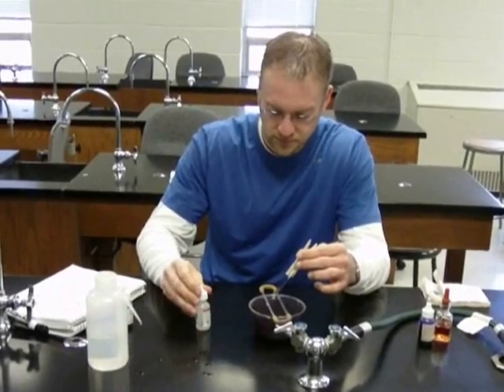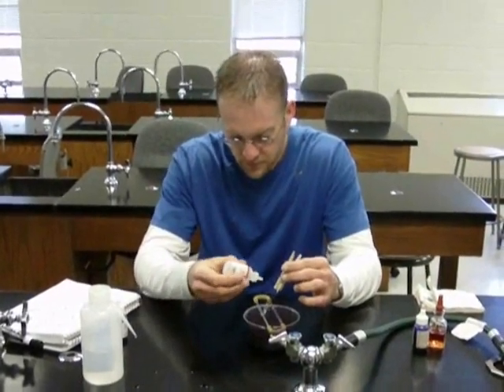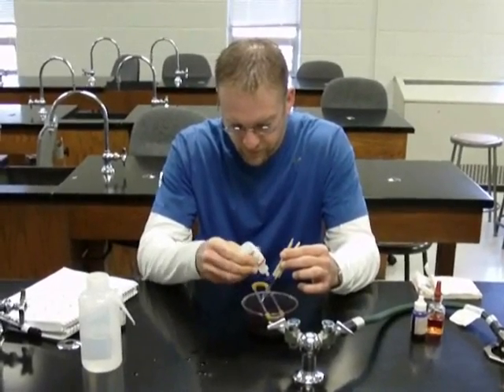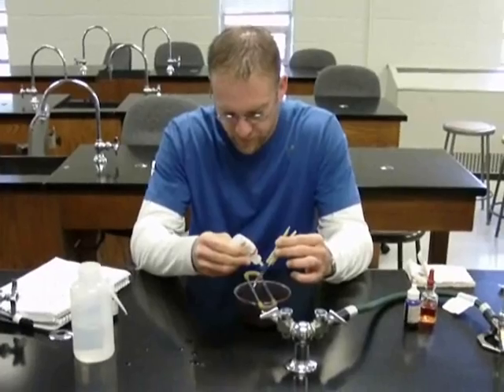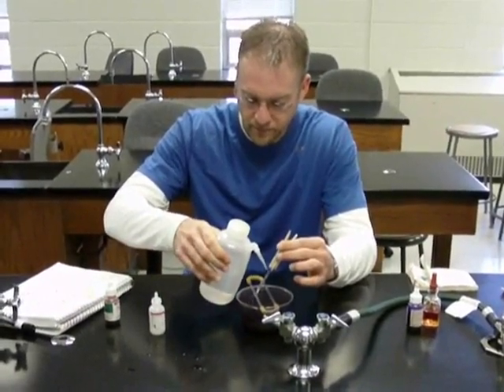Now he's going to add the alcohol solution to decolorize any Gram-negative bacteria on the slide. He doesn't want to decolorize it too much. Rinse with distilled water.